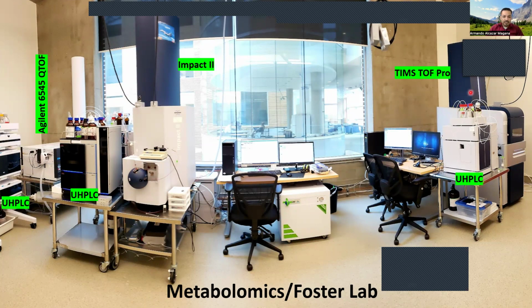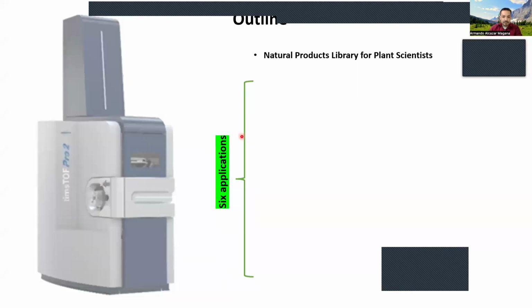Basically, this is the configuration that we use for mass spectrometry. We always have a UHPLC with a mass spec with different capabilities. These are time of flight, so they are high resolution. Here we have another HPLC behind the UHPLC, and we have another one. We have 3 high resolution mass specs, and another one is coming this fall.